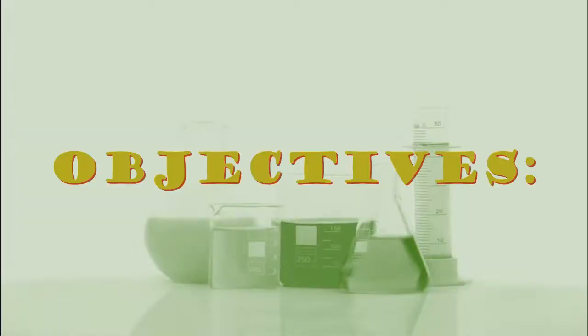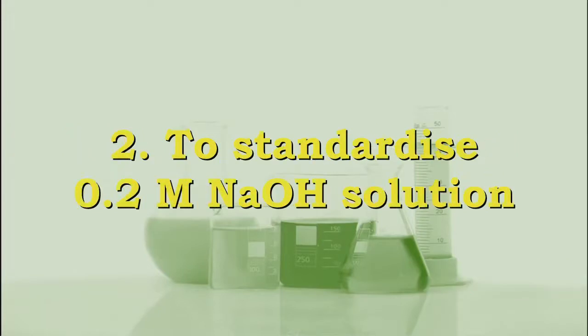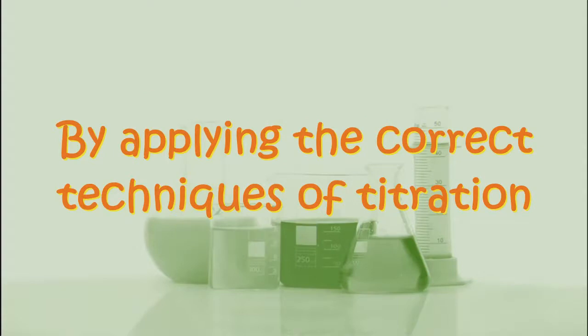Alright guys, if we look back at the objectives of this experiment, your first objective was to prepare the standard solution of oxalic acid. You did that successfully. Your second objective was to standardize the 0.2 molar sodium hydroxide solution, and your last objective was to determine the concentration of hydrochloric acid solution using titration techniques.